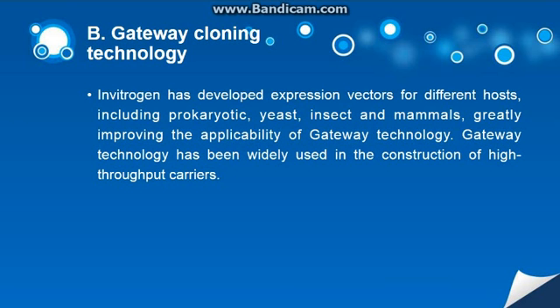Gateway cloning technology. Invitrogen has developed expression vectors for different hosts, including prokaryotic, yeast, insect and mammalian, greatly improving the applicability of Gateway technology. Gateway technology has been widely used in the construction of high-throughput vectors.